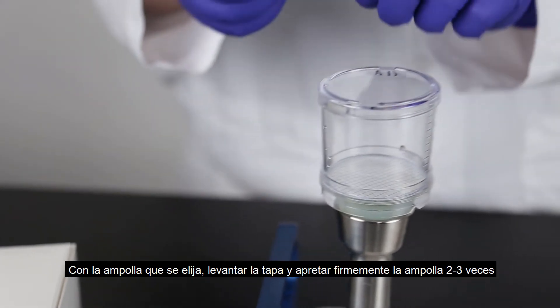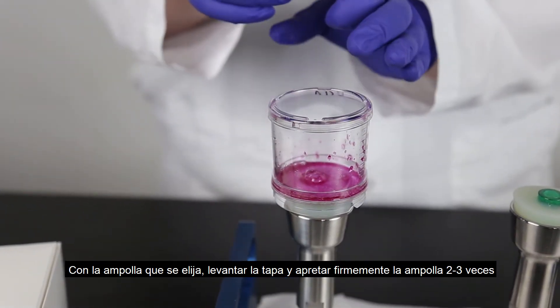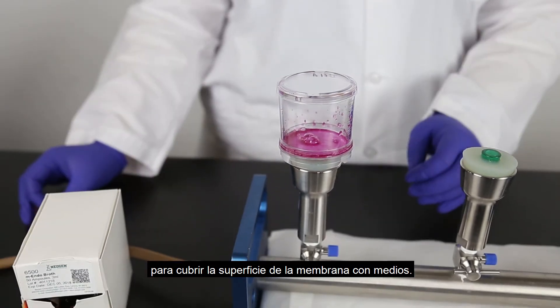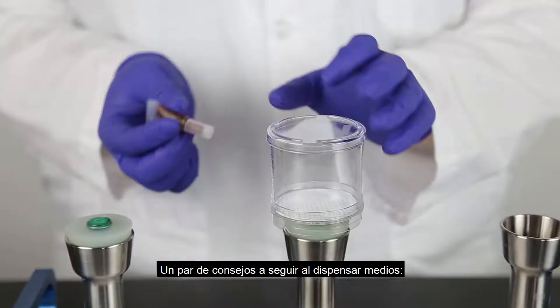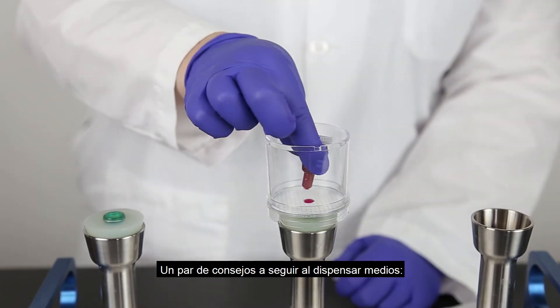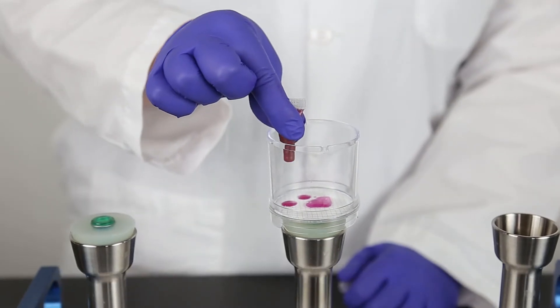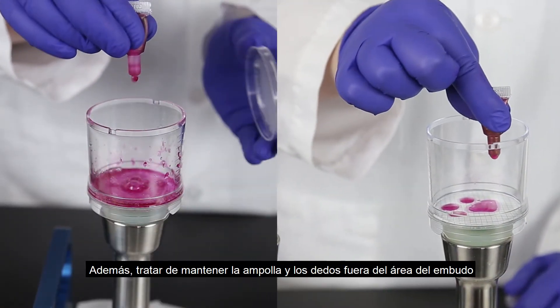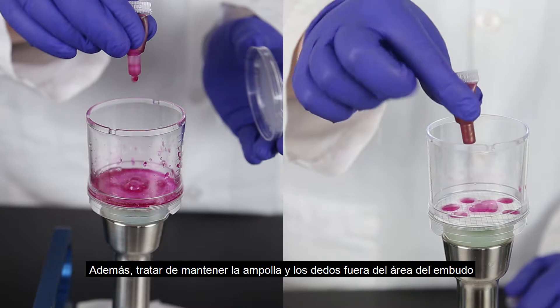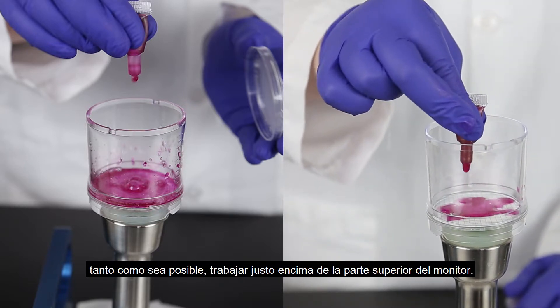Using your ampule of choice, lift the lid and firmly squeeze the ampule 2–3 times to cover the surface of the membrane and media. Here are a couple of tips when dispensing media: do not drip the media across the membrane and do not touch the membrane with the ampule tip. Also, try to keep the ampule and your fingers out of the funnel area as much as possible, working just over the top of the monitor.